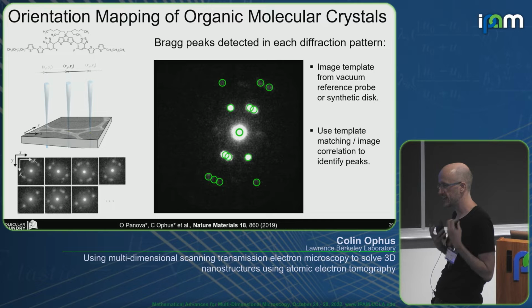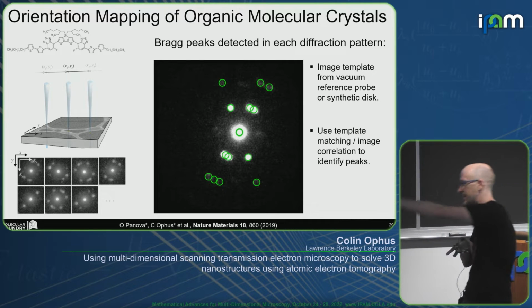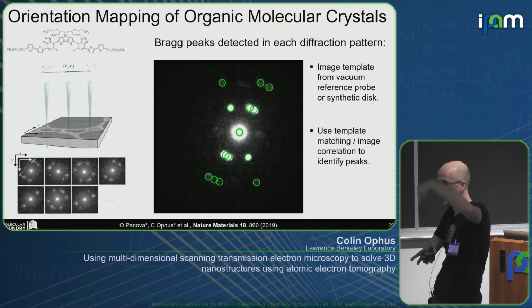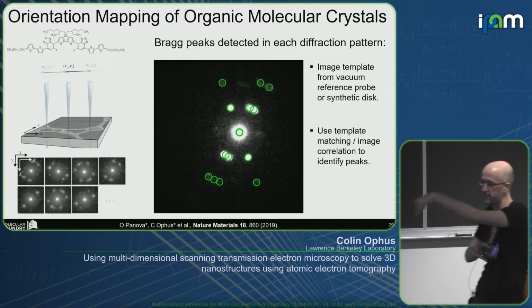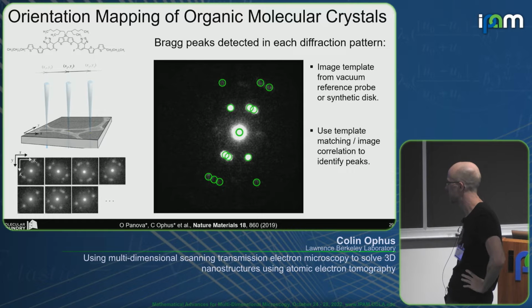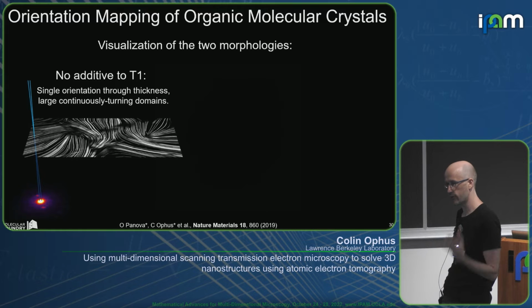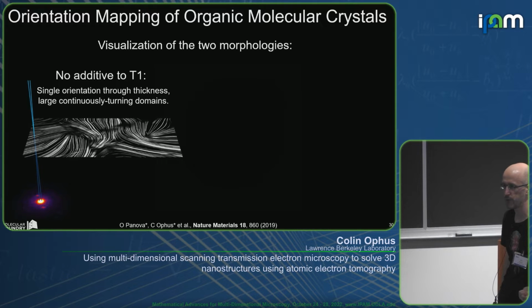And this is very much a destructive experiment. We measure the diffraction pattern and then take a 10 nanometer step because we've destroyed all the material under the beam. We have to step far enough into undamaged material to be able to make a good diffraction measurement here. But once we've done that, we can reconstruct the morphology of this soft matter sample.